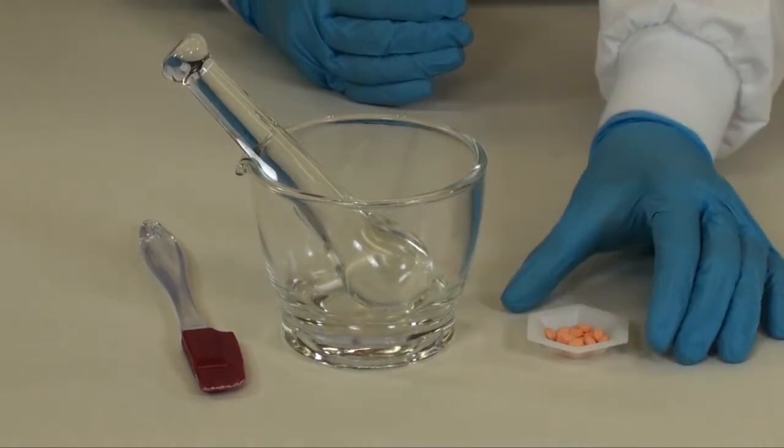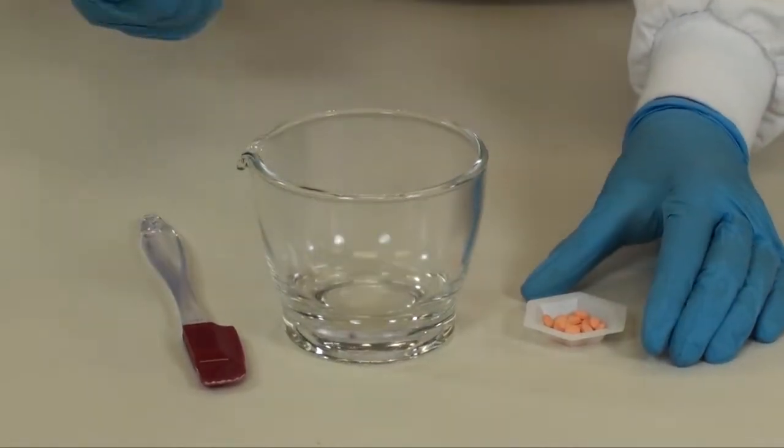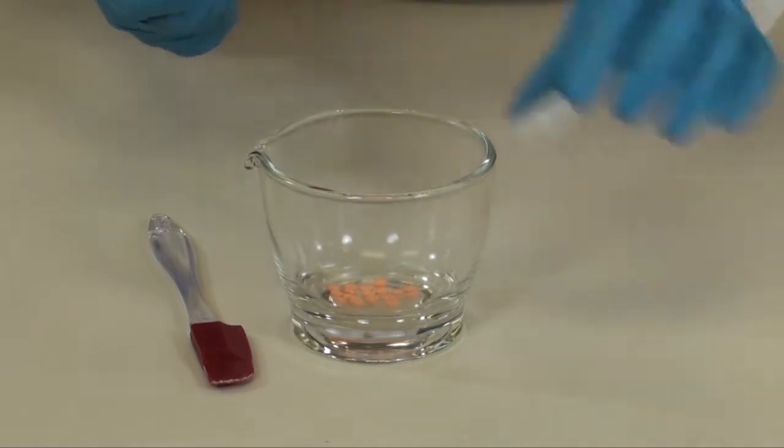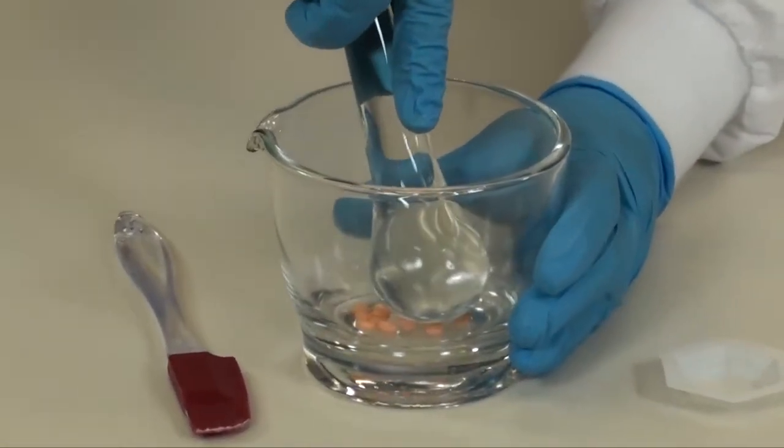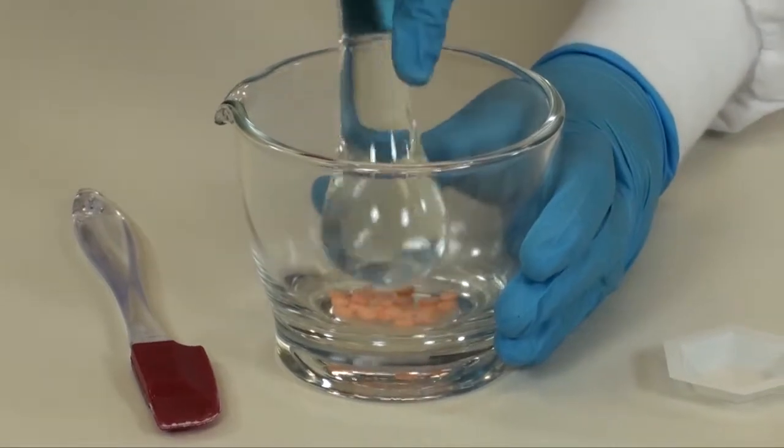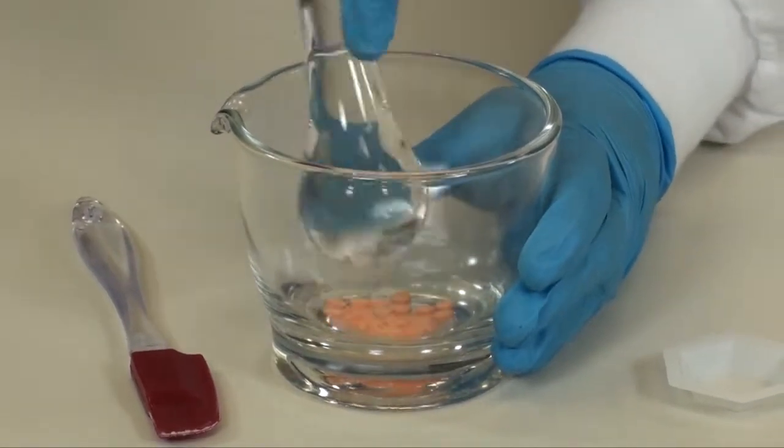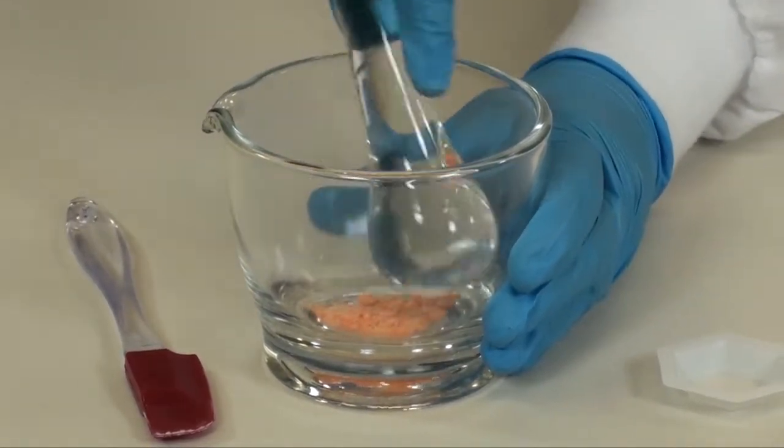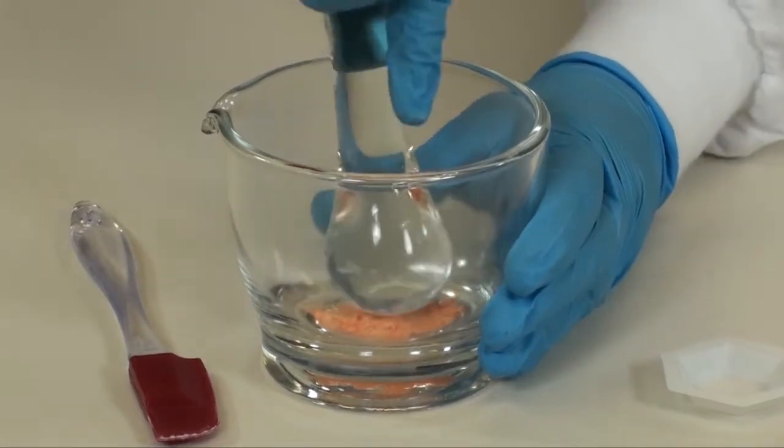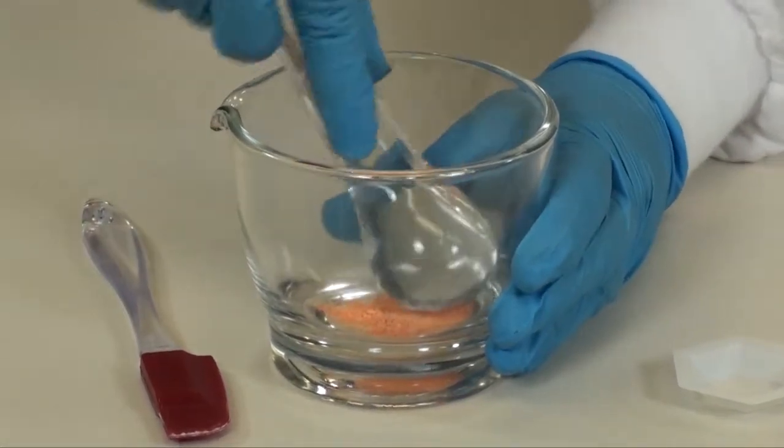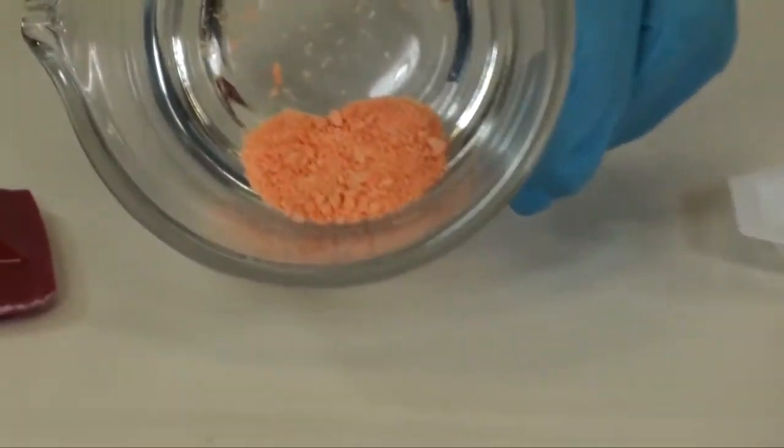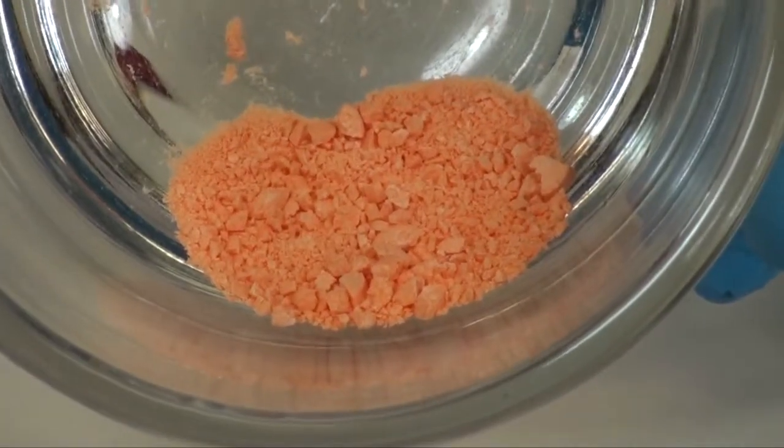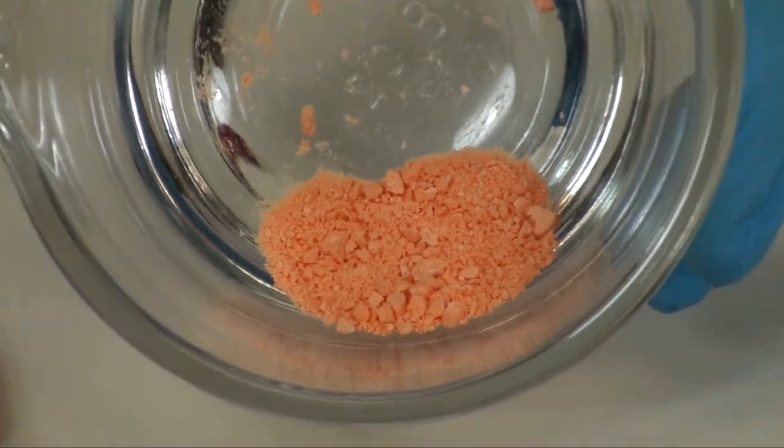Place the required number of propranolol tablets into your glass mortar. You are going to triturate to a fine powder. Initially, it's going to take a downward turning motion to start to break up the tablets. Don't stop here.